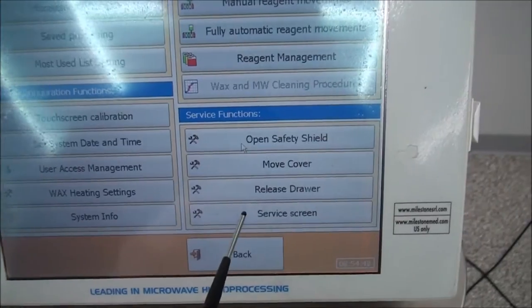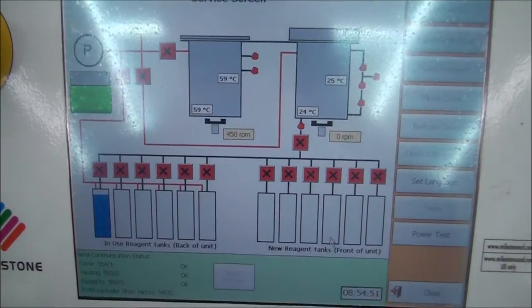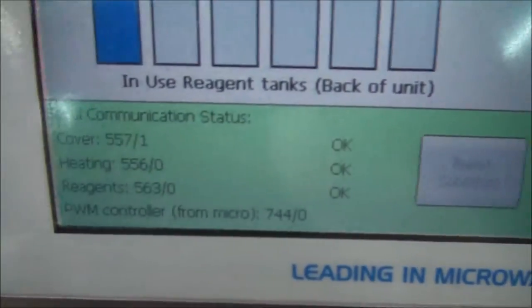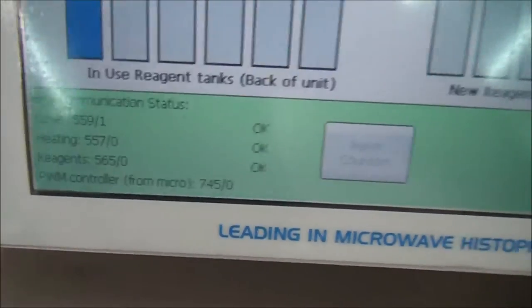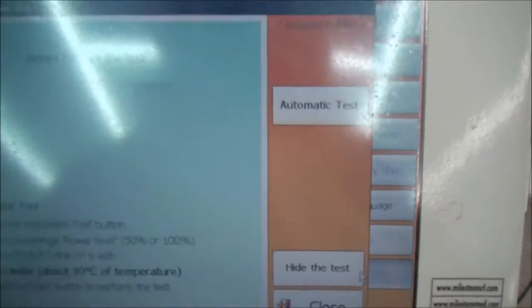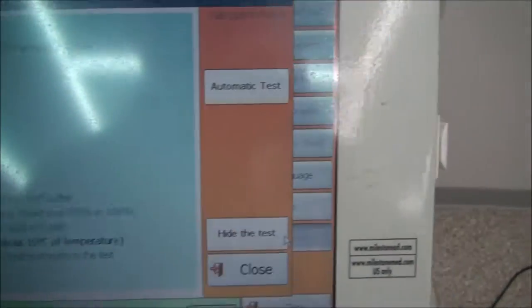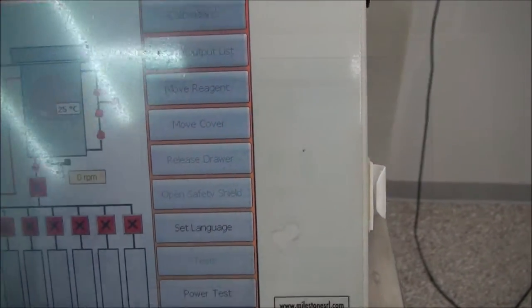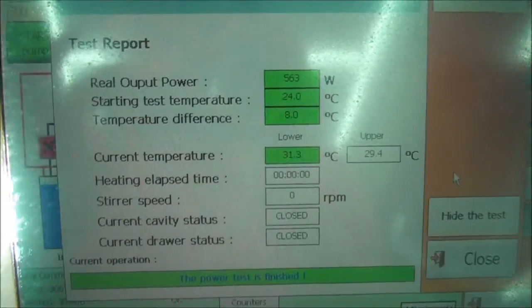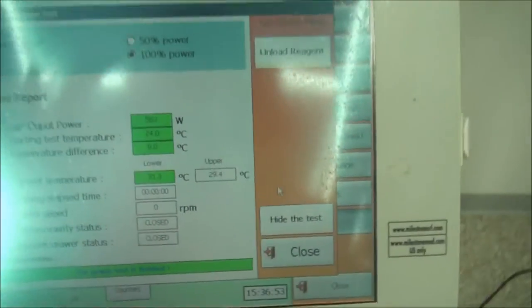Here you can see the service screen for the Pathos system. This screen displays various information about the system, including reagent tank levels. From this screen, you may also perform a power test, which measures the microwave output power of the system. This power test consists of loading cool water into the microwave chamber and then microwaving it. The before and after temperatures are then compared to determine the output power of the microwave, and you will see the results at the end of the test.